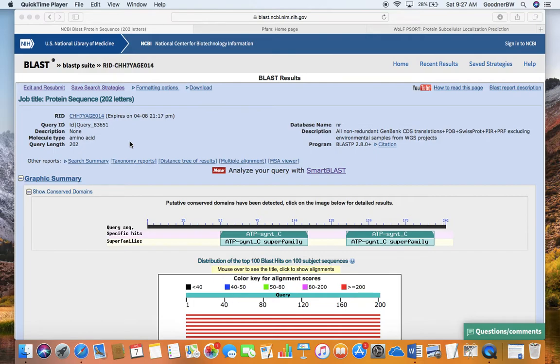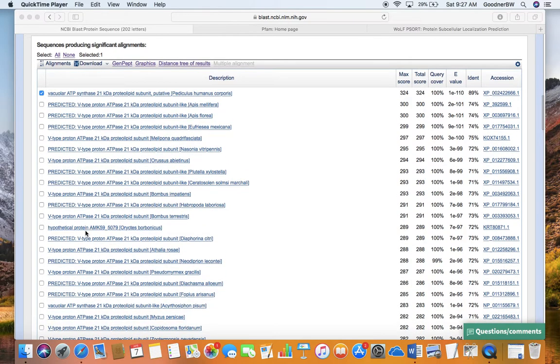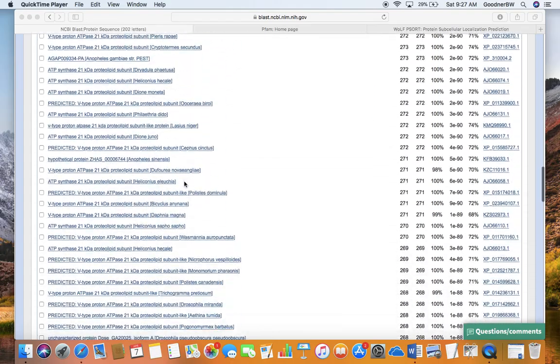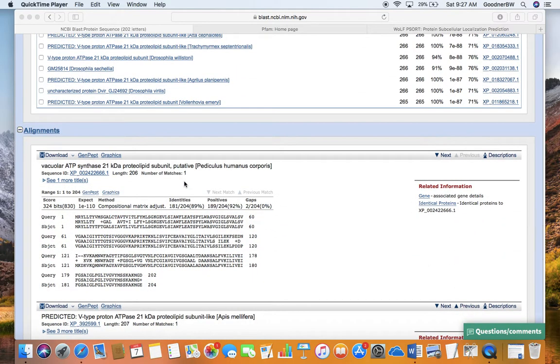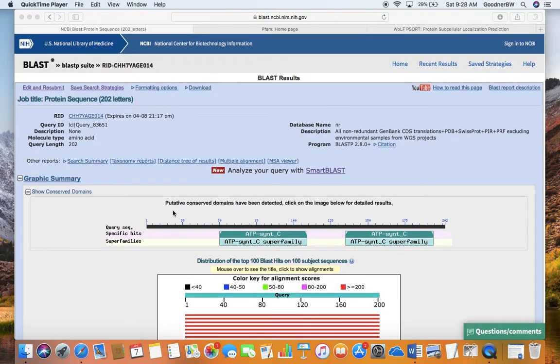And we're going to go back to the BLAST search results because there's actually a lot more data there. So here we are at the BLAST output page, and we've already learned how to interpret data here and look for sequences of interest and how we're looking at sequence alignments. Okay, but I'm going to scroll back up to the top, and you'll notice that, while this will not always happen, hopefully it'll happen for you, it will also show you if your protein has some conserved domains that have been seen before in proteins of known function.